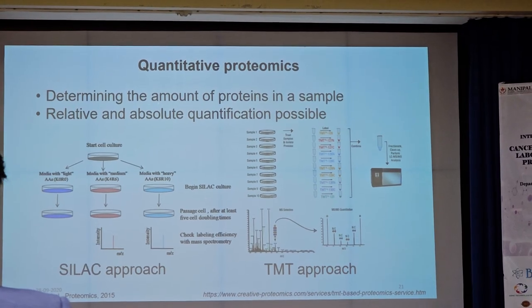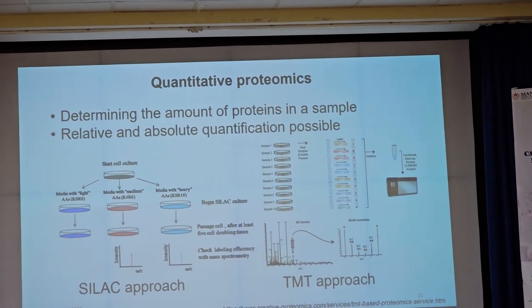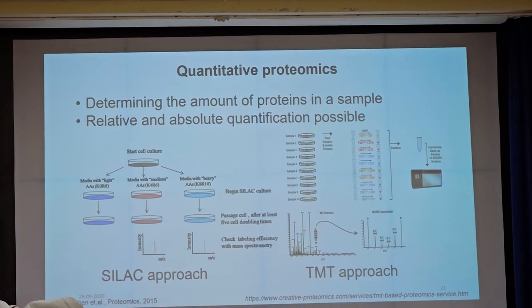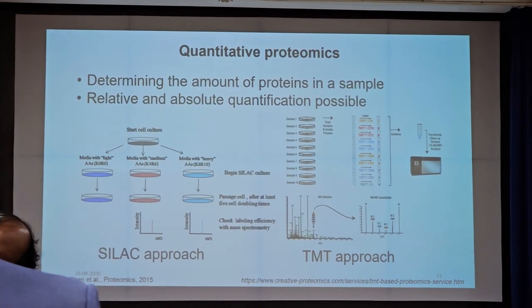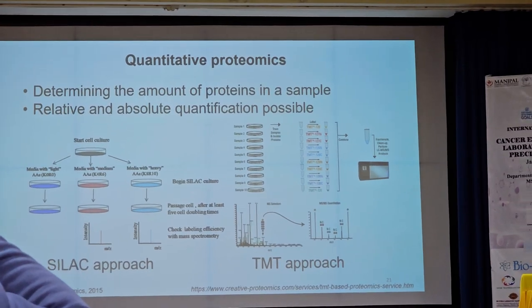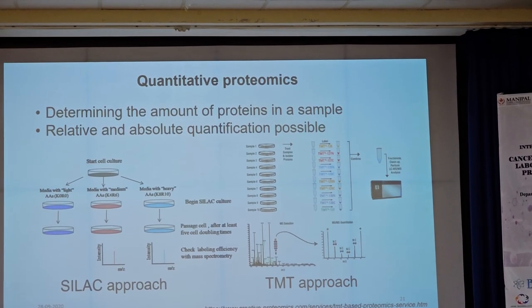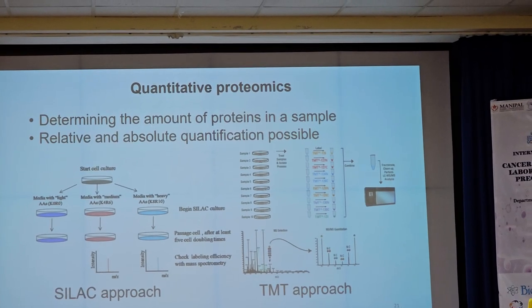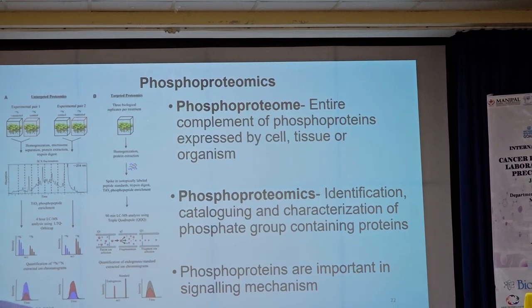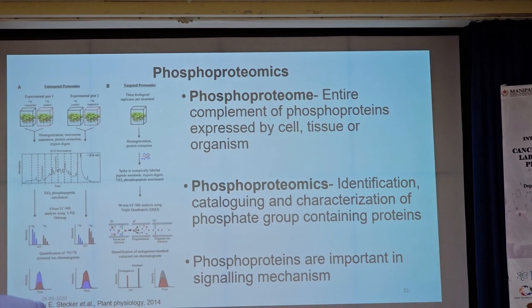So this is for protein identity. Now we will look at how protein expression is different across the tissues. We have methodologies in mass spec: labeled and label-free methodologies, SILAC, iTRAQ, TMT, several methods, with which you can determine proteins which are changing, and which proteins are modified by adding several functional groups.